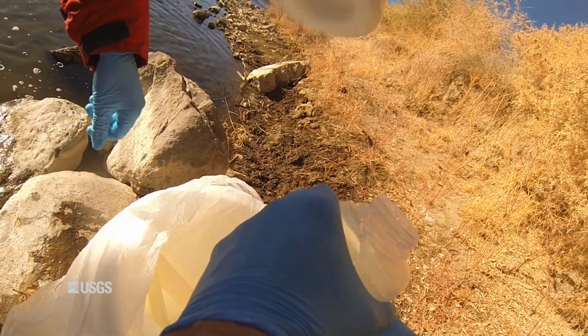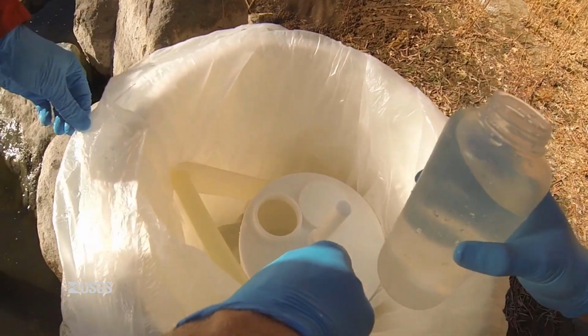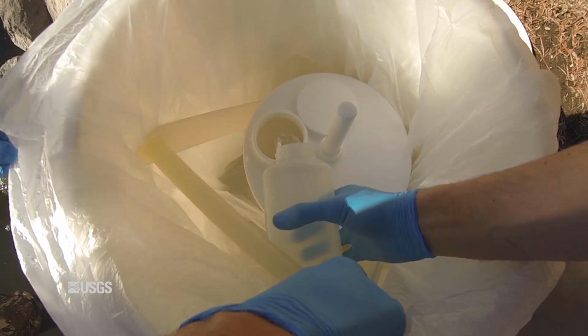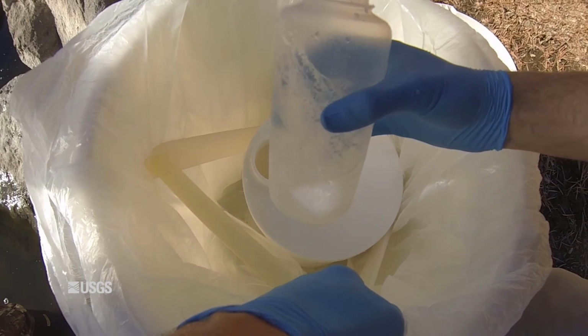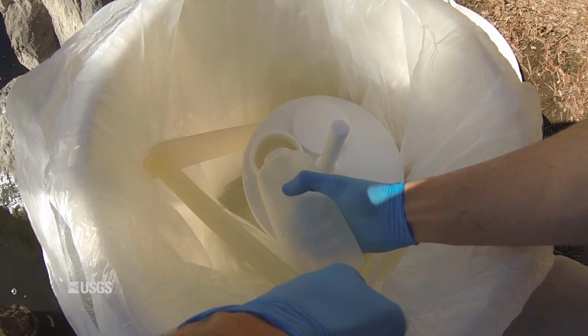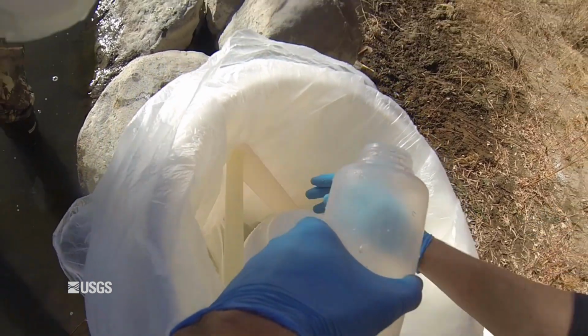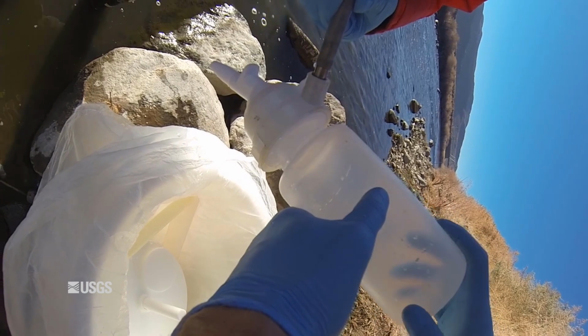Bryce and I practice a clean hands, dirty hands method of emptying the DH81. I, being the dirty hands, collect the sample and hold the sampler. Bryce, with clean hands, opens the churn and empties the DH81. Towards the end of the bottle being emptied, you see Bryce give it a swirl to get any solid material stuck in the bottle out. Bryce changes his gloves often in the clean hands role, doing his best to avoid contamination of the sample.